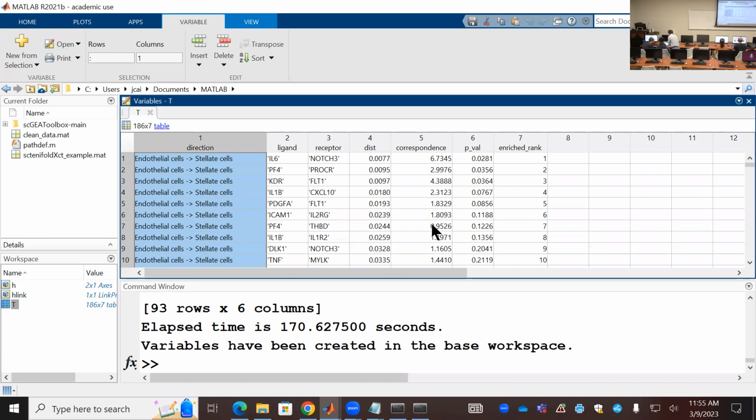Some problem in installation. Did you install this? So that's basically this is missing a function. This function is supposed to be in one of these folders.